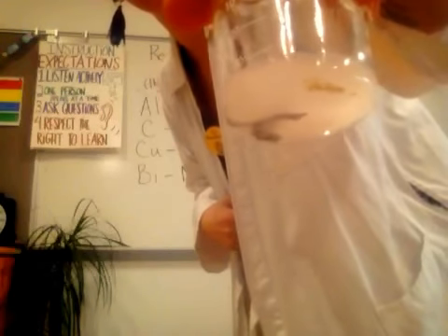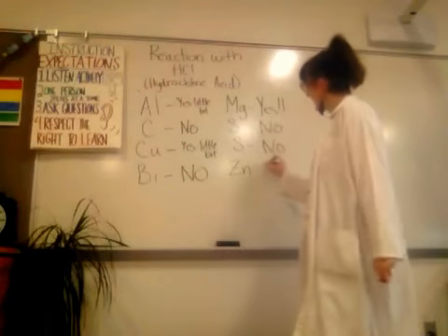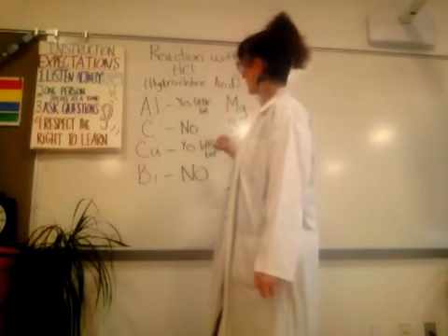Then we've got zinc. So zinc took its little time. There is a slight discoloration in the hydrochloric acid. There are small little tiny bubbles, and you might be able to hear it. No, it's a little bit tricky to hear, I'm sure. So that one is a yes, but not as small an amount as aluminum or copper.